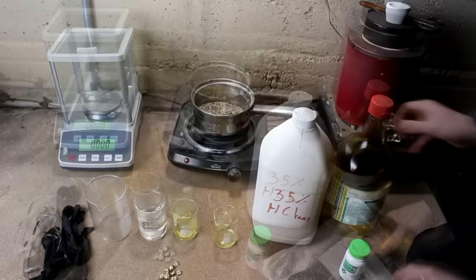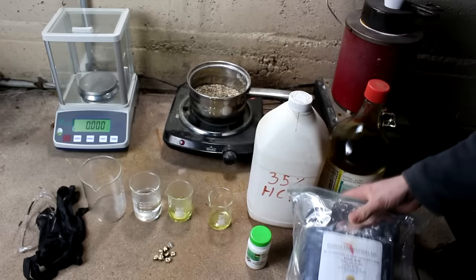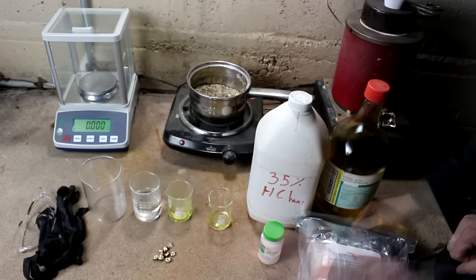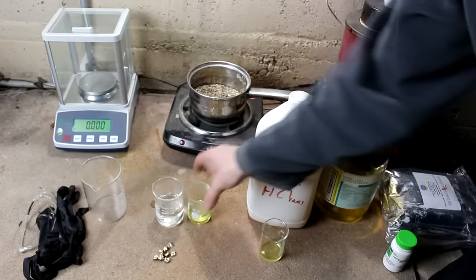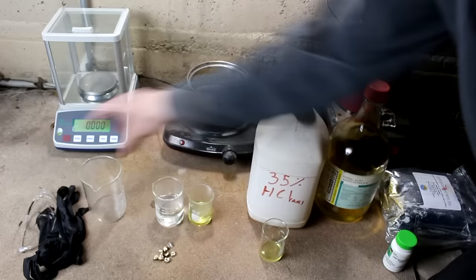I'm also going to need various chemicals to selectively bring the metals back into a solid state. I have oxalic acid for the gold reduction and dimethylglyoxime for the palladium reduction, but I'll talk more about these later. For now I've got two beakers here of the acids measured out — 40 milliliters of nitric and 100 milliliters of hydrochloric. I'm going to add the nitric slowly as it is consumed in side reactions.